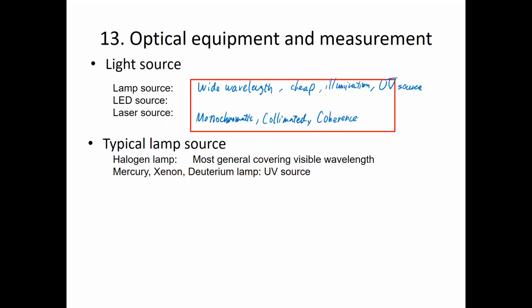By inventing the laser, we can now use various interference measurements, and also the laser can be focused down to a very small spot, like 1 micron. That's why now we can use a laser scanning measurement. So at each spot you can obtain the response or photochemical responses.